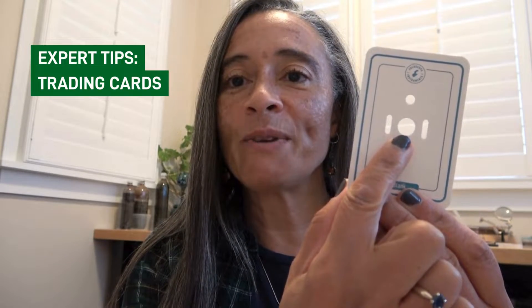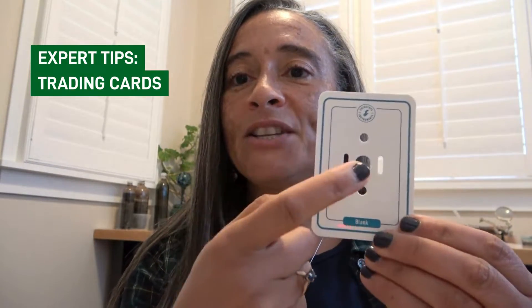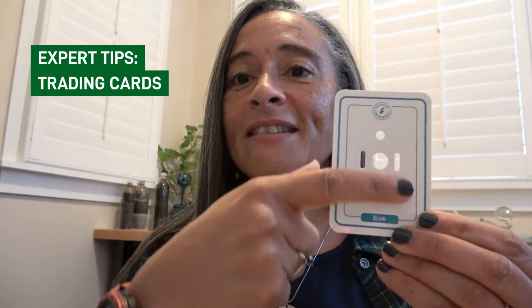As you can see, a trading card is the size of a regular playing card and it's made of a waterproof paper. Your sample goes in that center hole right there and it's sandwiched in between two clear stickers. So you can just put a clear sticker on the back, place your sample on the front, and then seal it onto the card with another clear sticker.